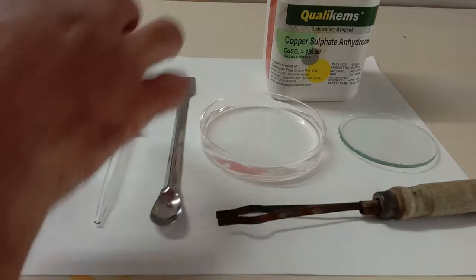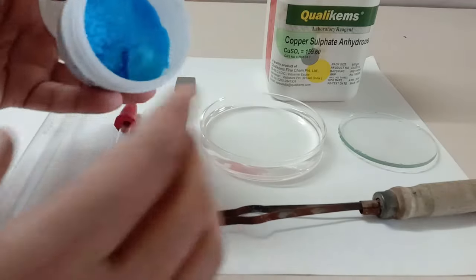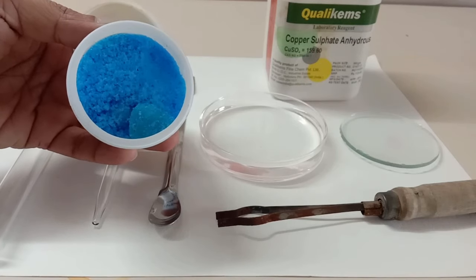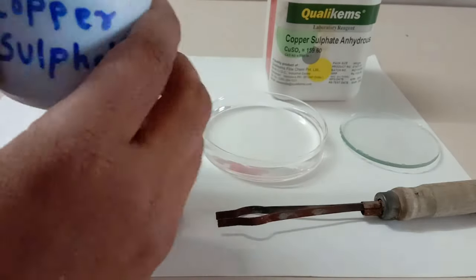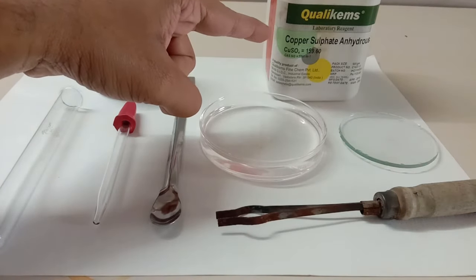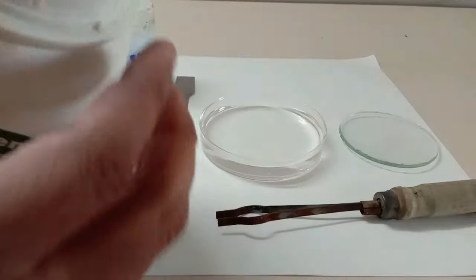For this demonstration, I have taken this copper sulfate, which is blue in color, as you can see. Anhydrous copper sulfate, which is only CuSO4 without water molecules, is dirty white in color, guys.